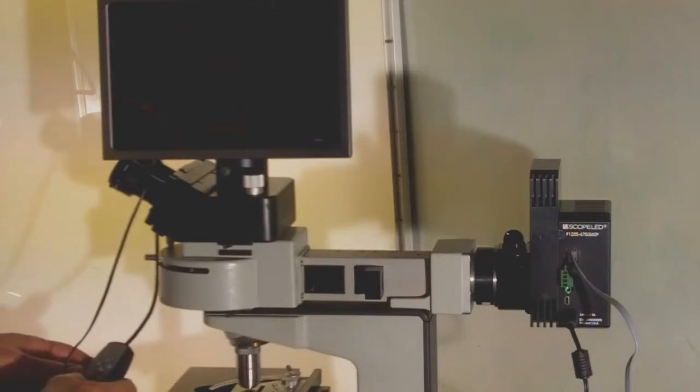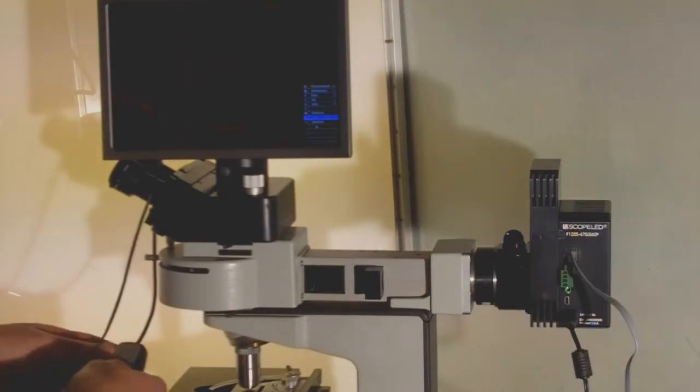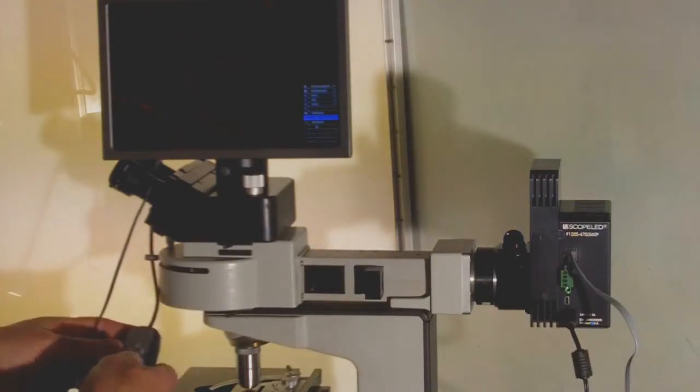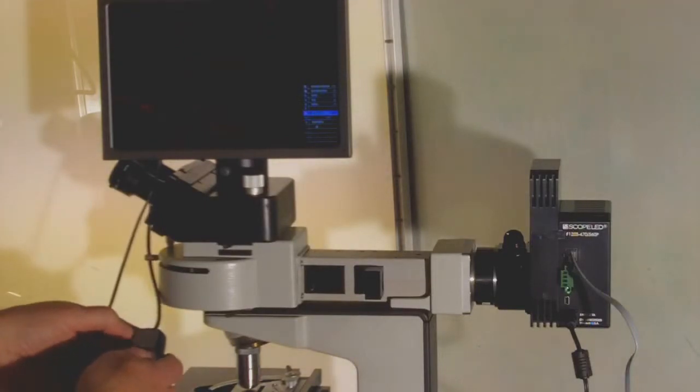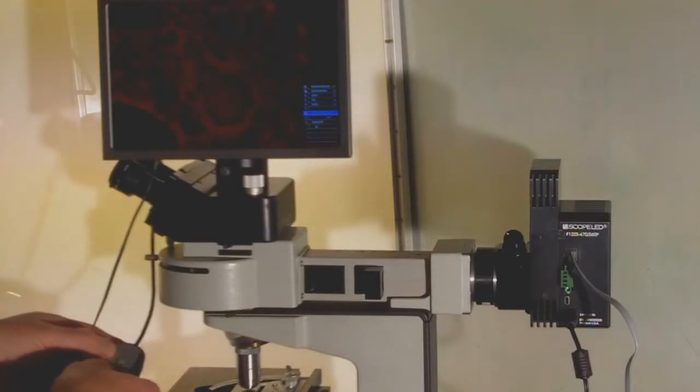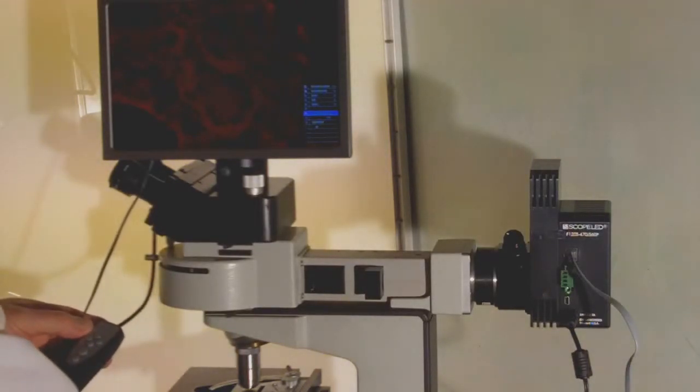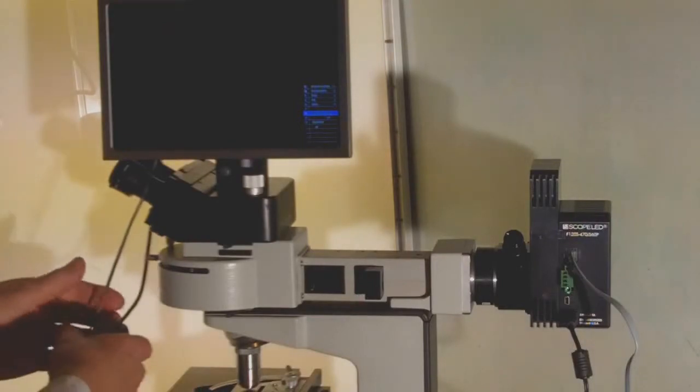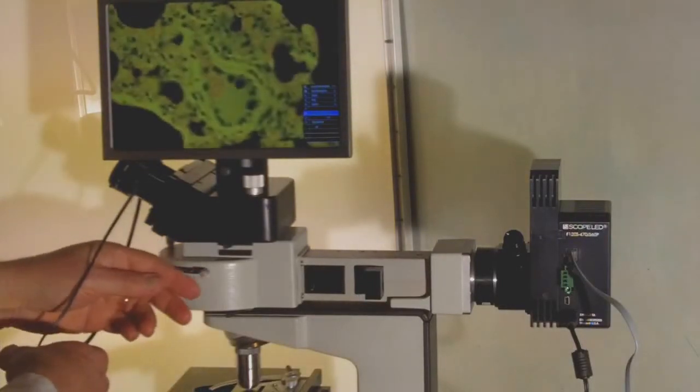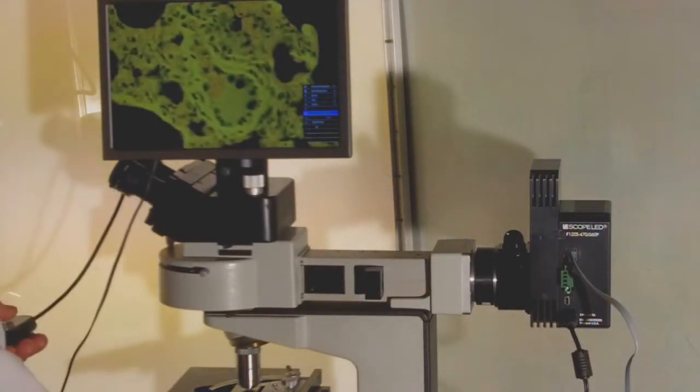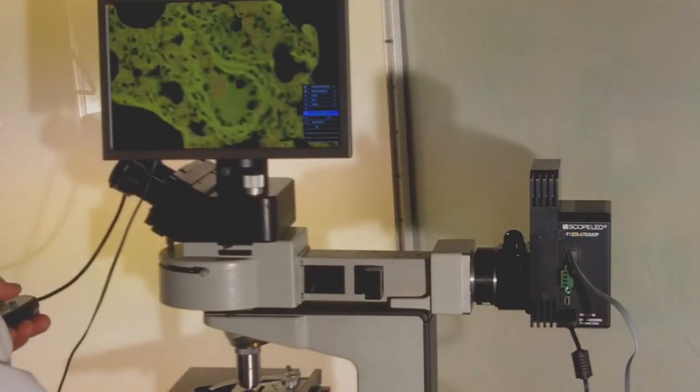With the camera, we can go to the control unit and tweak up the intensity a bit more, tweak up the sensitivity. There's that same lung tissue, again back to blue light excitation, which gives us green Stokes shift emissions.